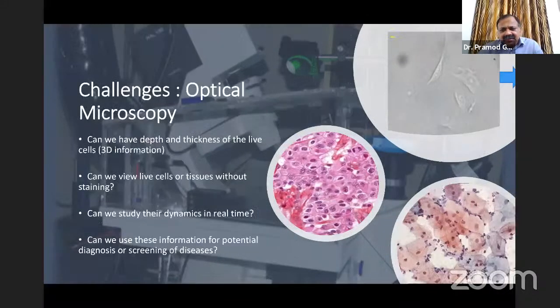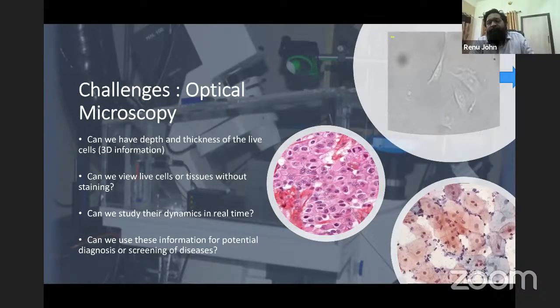Those are very easy. We make them on our own. These are polymer channels, which are very easily possible. You make one master template and you can make as many channels as possible on PDMS and similar materials. So these are very easy.